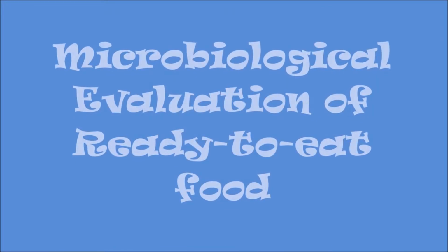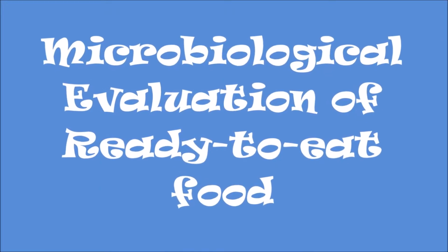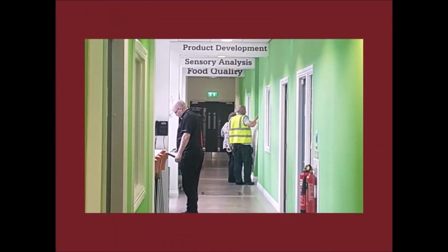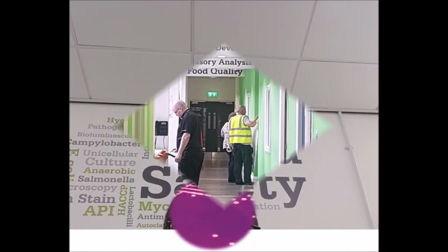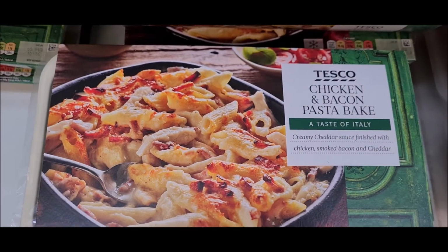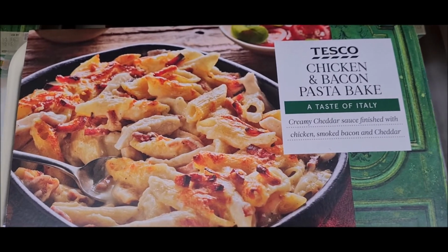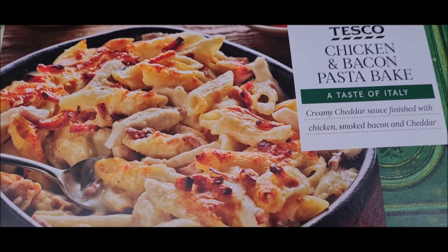Welcome to the interactive video presentation on microbiological evaluation of ready-to-eat foods. In this video, you will be watching a demonstration on how to microbiologically evaluate a ready-to-eat food to decide whether it is fit for human consumption or not. You will learn how to use microbiological guidelines in making decisions on fitness for human consumption of a ready-to-eat food.